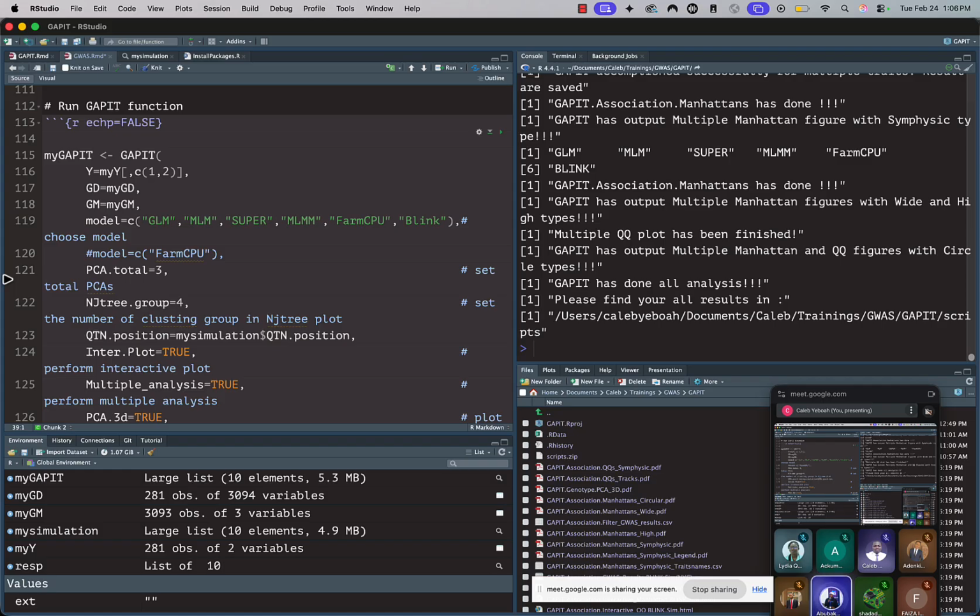Okay, so when I tried to run that, there is an error saying that the installation of package 'later' had non-zero exit status. There is also a warning that this package has a configure script and it probably needs manual configuration.